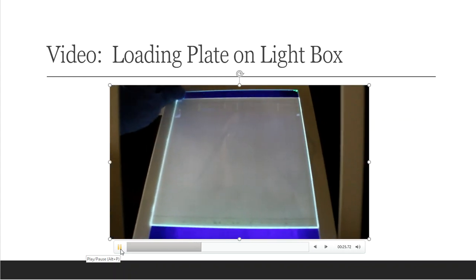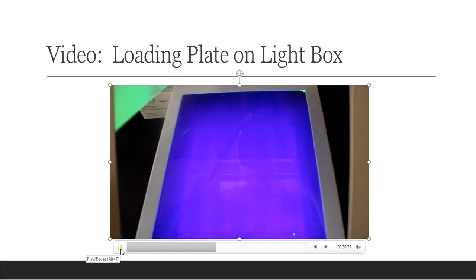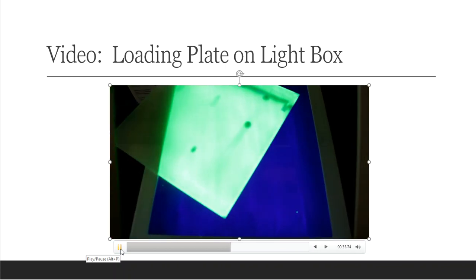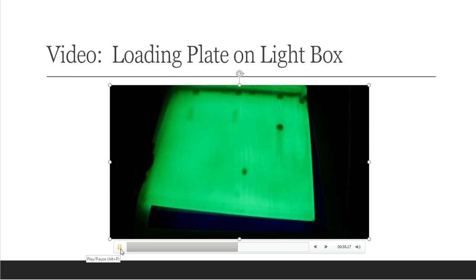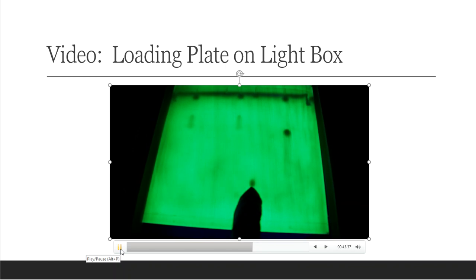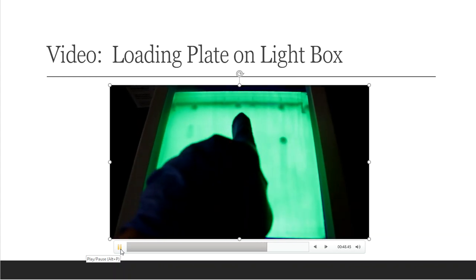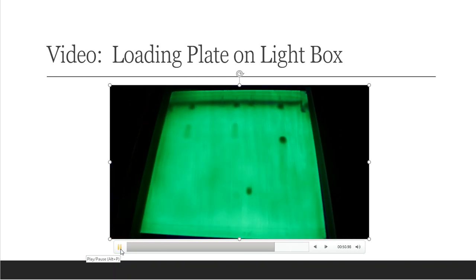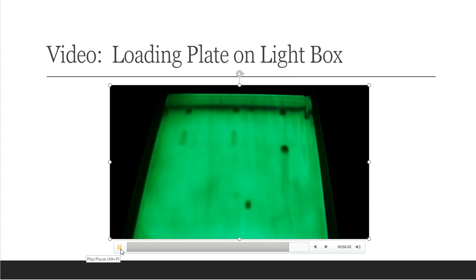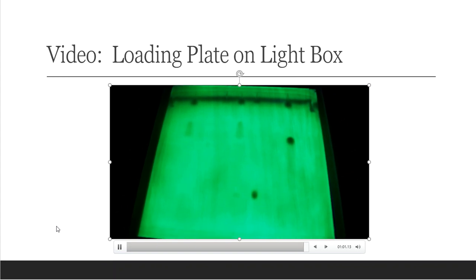So I'm going to open the lid back, and I'm going to flip the plate over so that way the silica with the indicator is now facing the UV light, and you automatically see a difference in the indicator and the plate. So you're seeing a dot here, you're seeing a dot there. It looks like another dot's way up here. I see something there, I see something there. So it's going to be my job just to circle these wherever I see those dots or spots and then go back and do my measurements. So that's the way to load up the TLC plate on the transilluminator box.